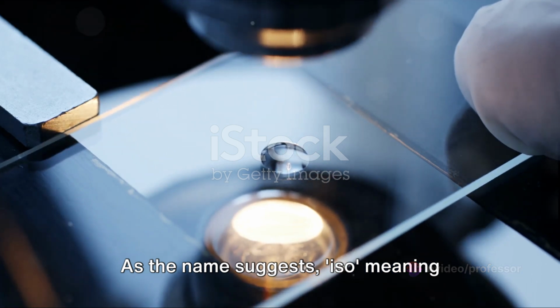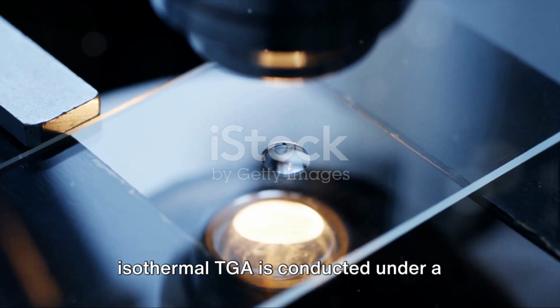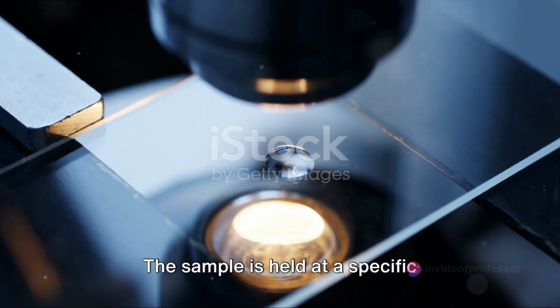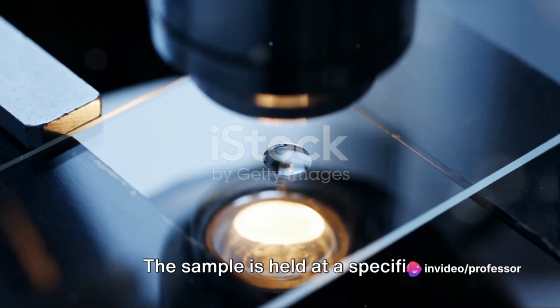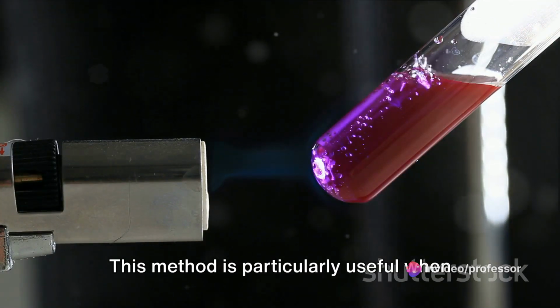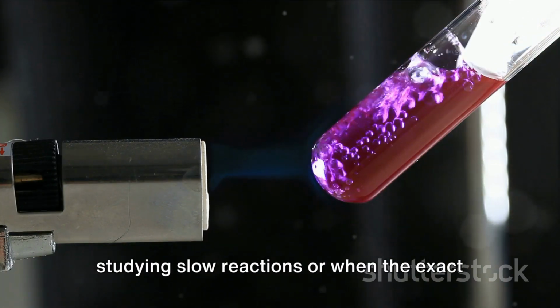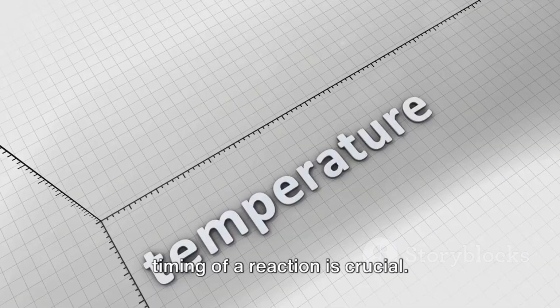As the name suggests, iso meaning equal and thermal referring to heat, isothermal TGA is conducted under a constant temperature. The sample is held at a specific temperature, and the change in its mass is monitored over time. This method is particularly useful when studying slow reactions or when the exact timing of a reaction is crucial.